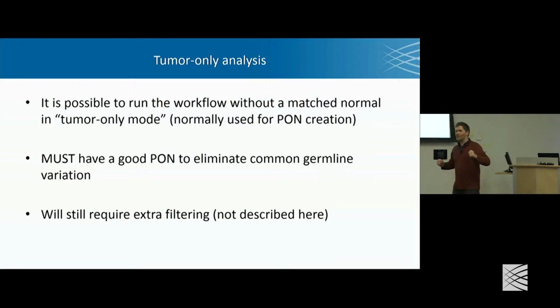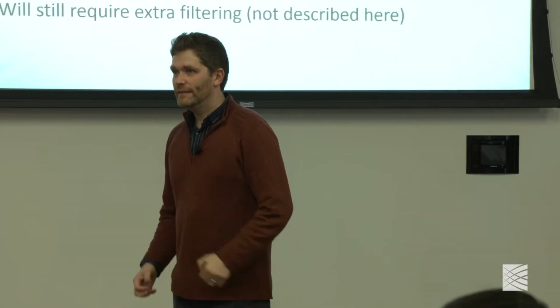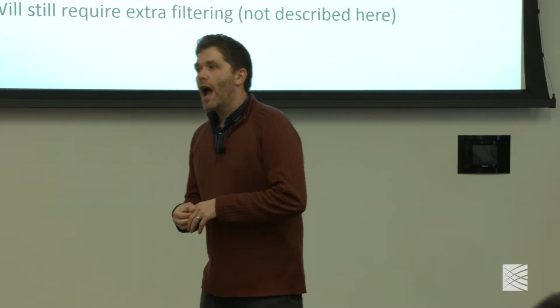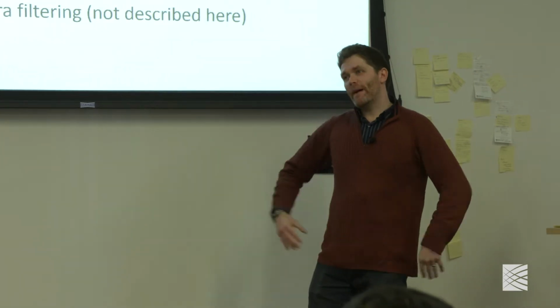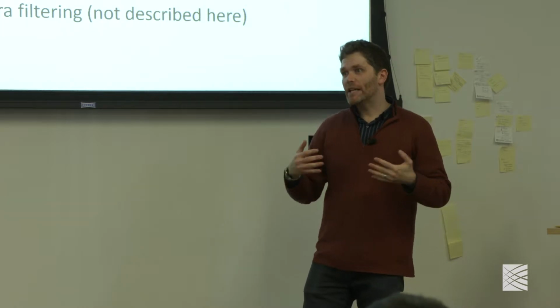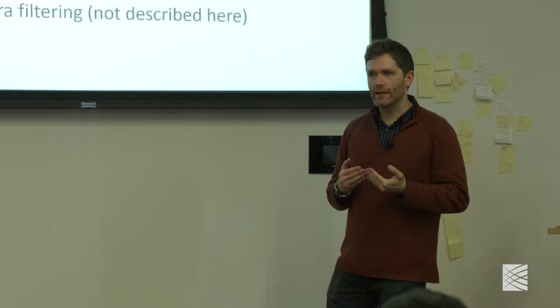Oh, questions, awesome. I'm not sure we're going to talk about that in the future, but will you go over discovering somatic variants from RNA-seq data? Is the workflow pretty similar for that? Okay, so if I zoom out enough, I can answer that question with yes. I don't know that in this workshop there's any talk of calling somatic variants in RNA.